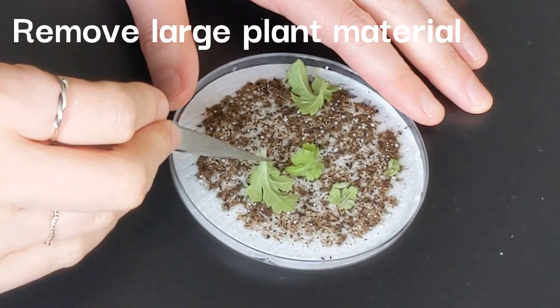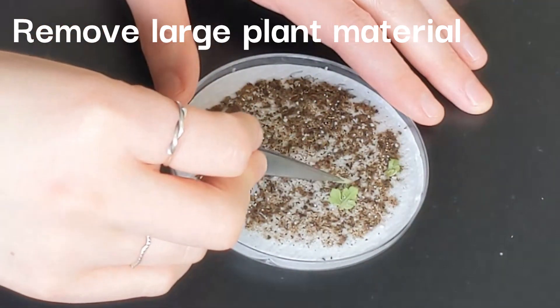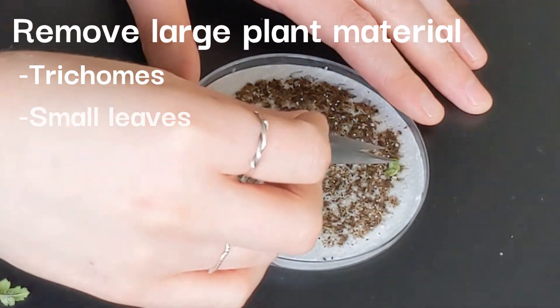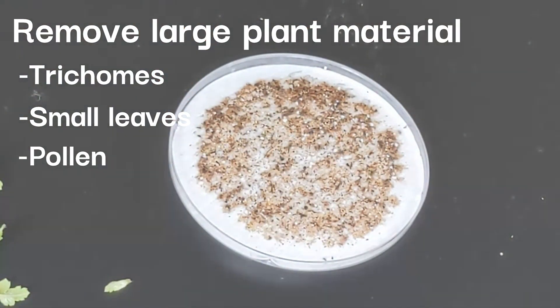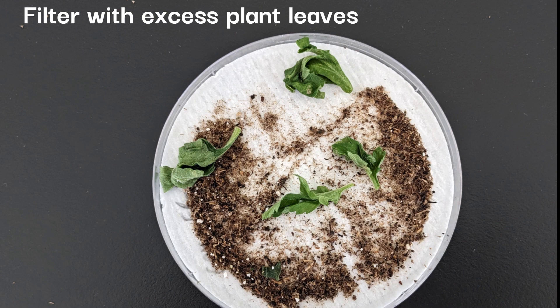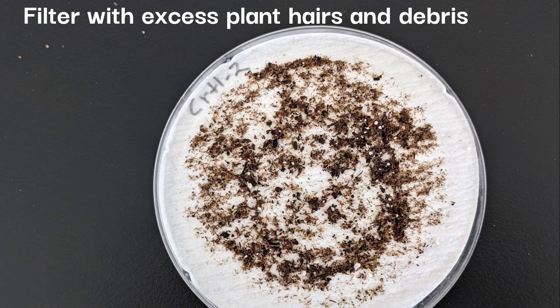Take the big chunks of plant material out of the filter. If there is lots of small plant material on the filter, such as trichomes, small leaves, or pollen, this will make counting and identifying thrips and other pests very difficult. If this happens, you may need to wash more samples of a smaller amount of plant material, or strain the water through the sieve without the filter first to eliminate large chunks of plant material and then go ahead with the filter.